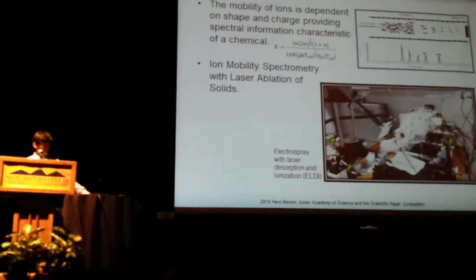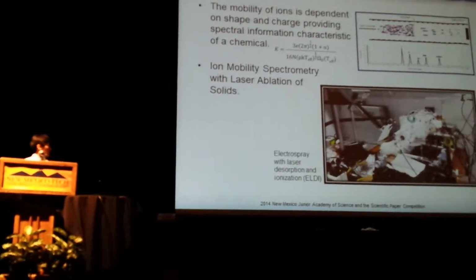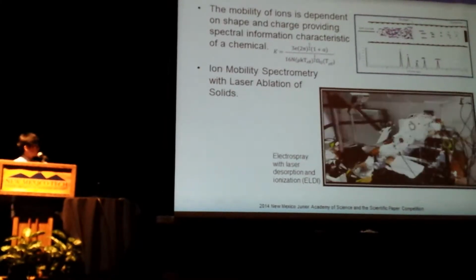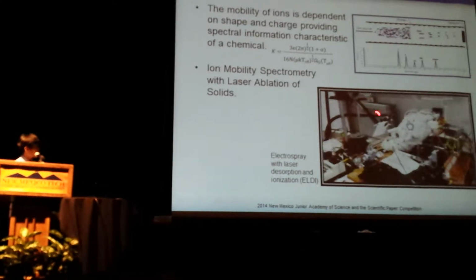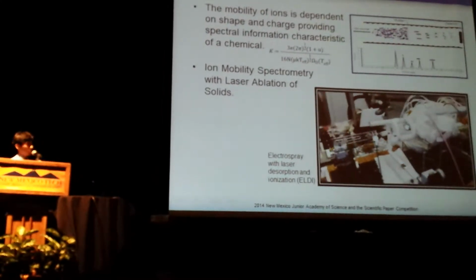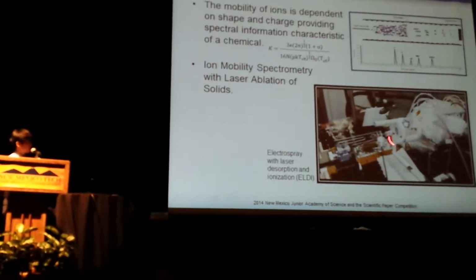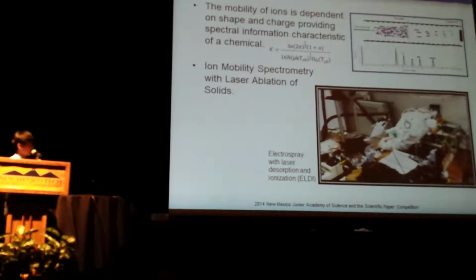Here's a short clip of my experiment. This over here is a laser that's hitting a tablet. Over here is an electrospray which sprays the ion plume into the drift tube, which is this apparatus back here.